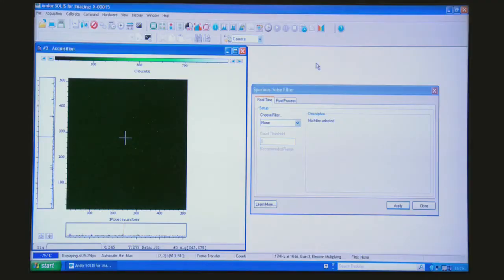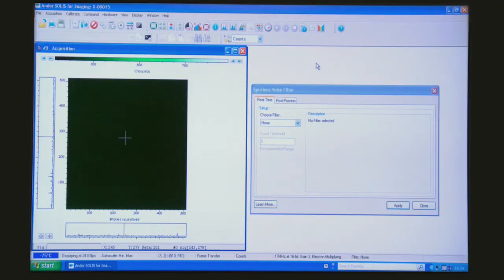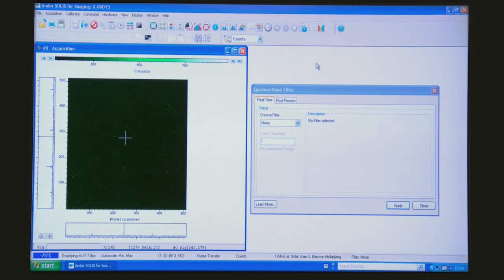So what we can see running live on screen is a speckly salt and pepper background, again with deliberately heightened clock-induced charge. But in an experiment this may as well be photons in the background.